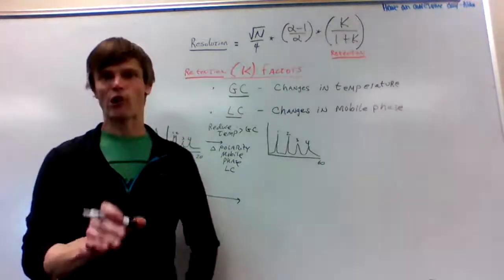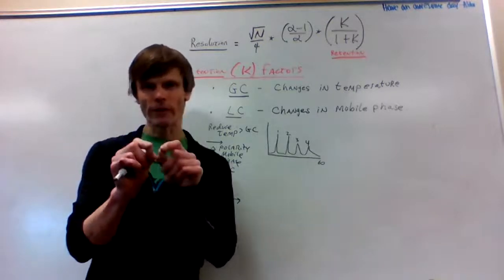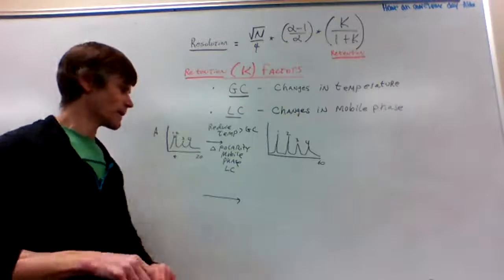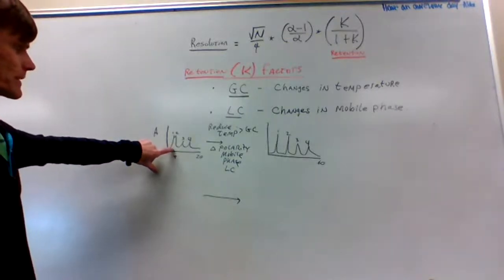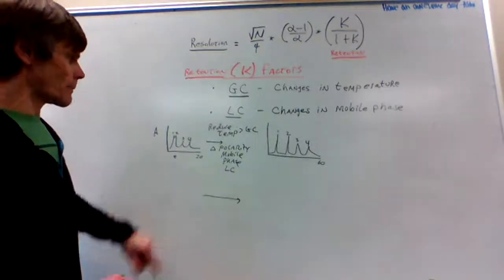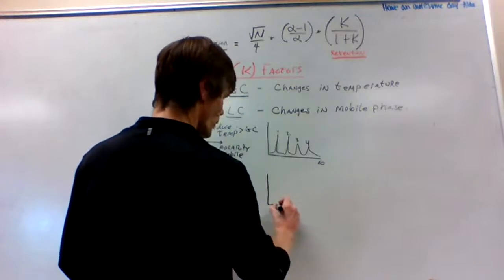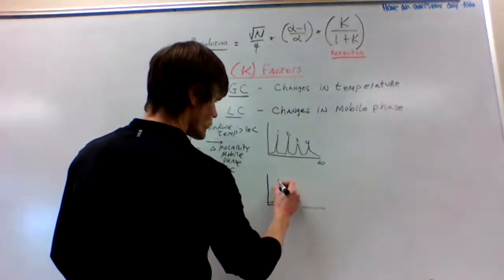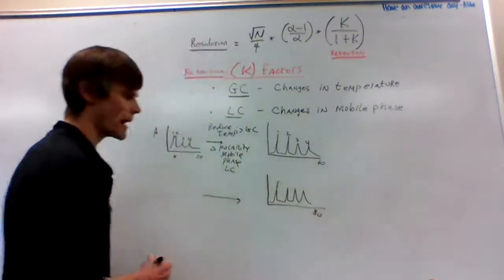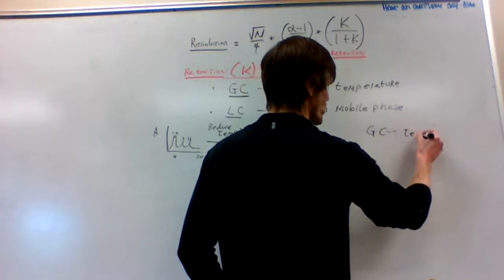In gas chromatography, we can do what we call programming or ramping our temperature, temperature programming. So what we do in this experiment, we start at a lower temperature, and then we gradually increase the temperature throughout the experiment. And what it will do is it'll encourage these species that come off sooner to be retained a little bit longer and get our separation. And then these species that come off a little bit later, well, now that the temperature's higher, they can come out of the column a little quicker. And using temperature programming, we can get good resolution of all species in a time that might be better suited for what we want. So for gas chromatography, temperature programming.